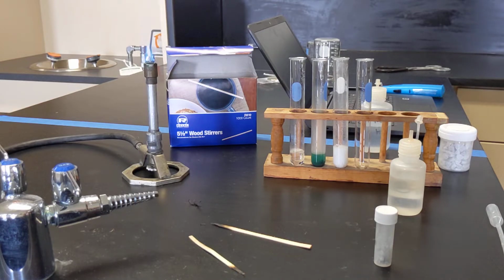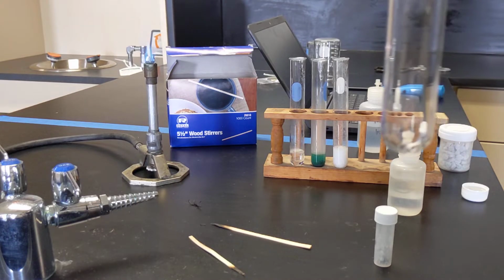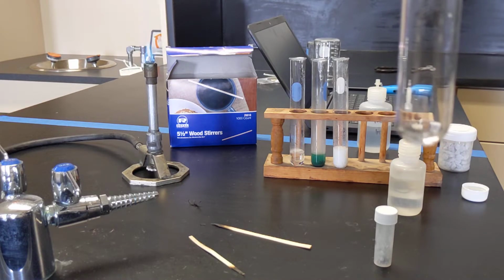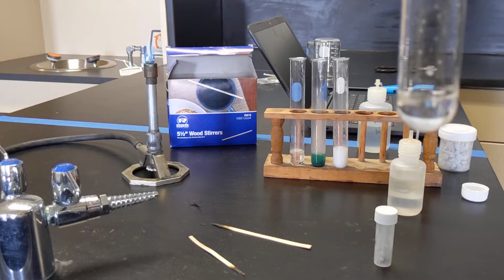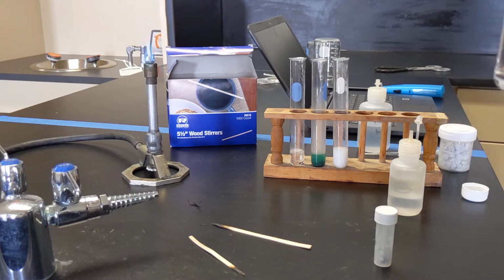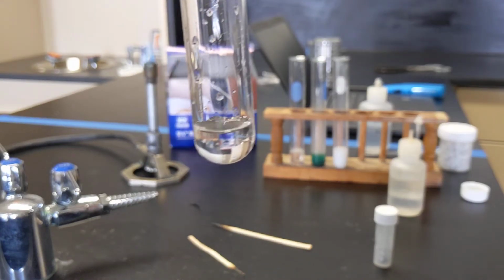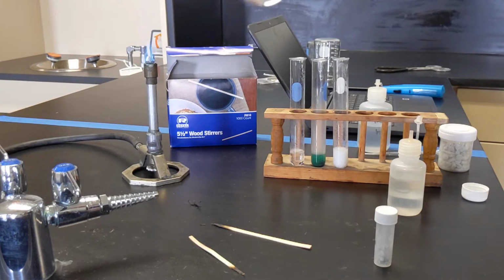Okay, and reaction 5 is the decomposition of hydrogen peroxide. So I need to put 20 drops of hydrogen peroxide in my next test tube first. This is just over-the-counter hydrogen peroxide. 1, 2. That's about 20, we'll say. And then I need the itty-bitty baby bit of manganese dioxide, which is how it's commonly known.